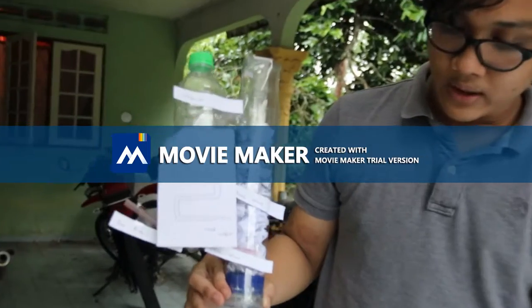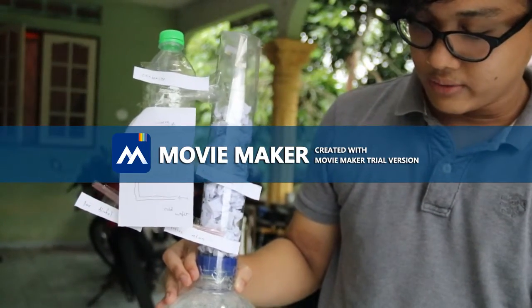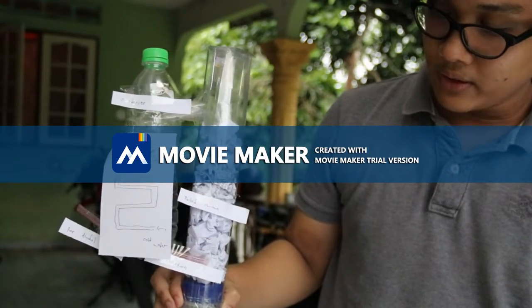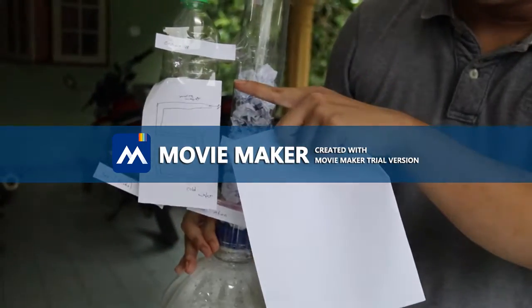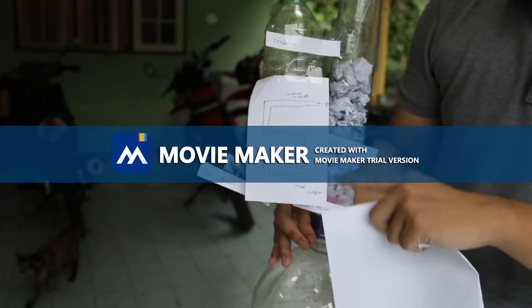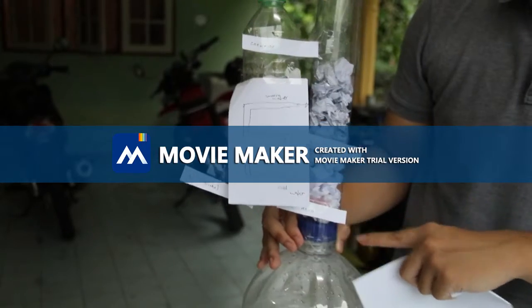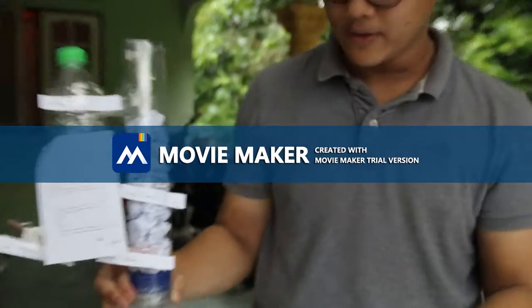So the idea is that the mixture solvent is evaporated through the boiler, through the packed column, and into the condenser. And after that, the pure alcohol will be extracted here, and then everything that hasn't been extracted yet returns into the reboiler.